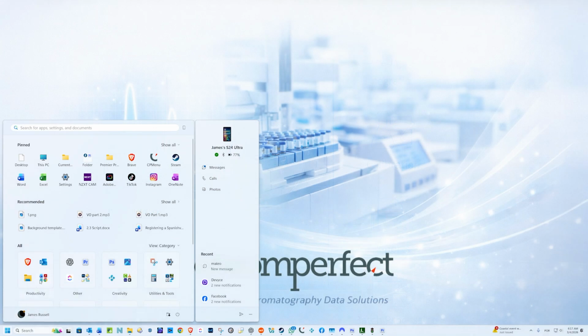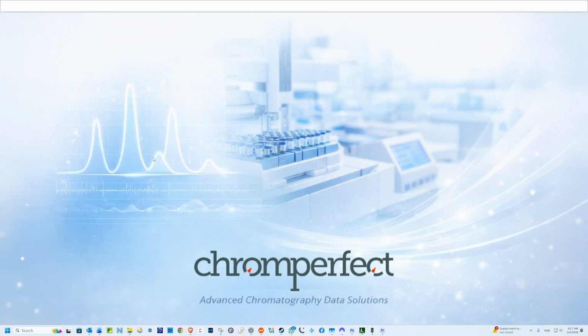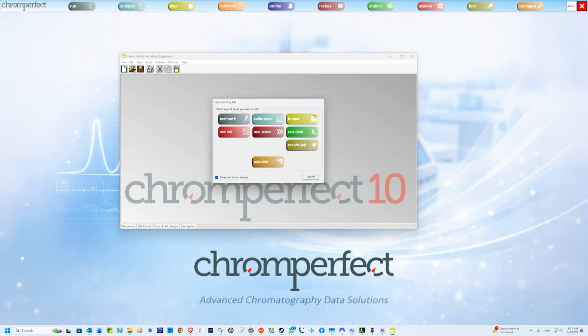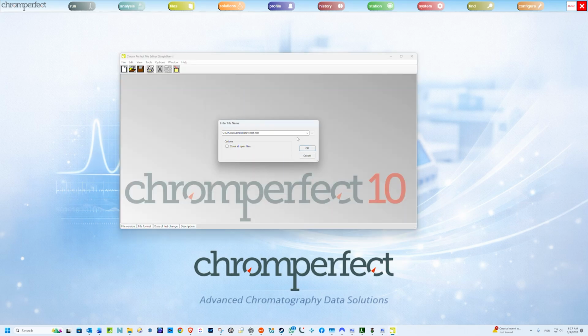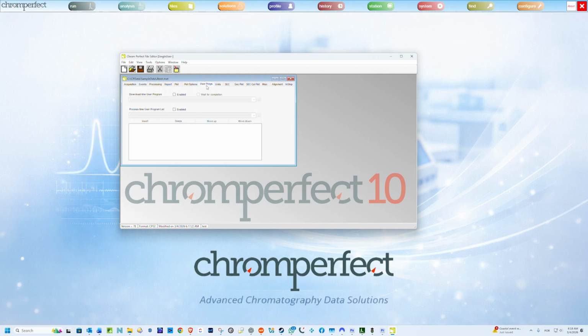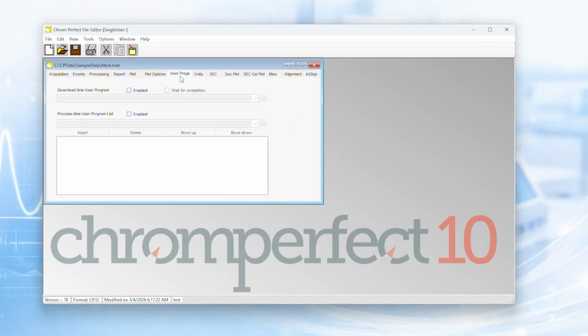When you first open the method editor, the number of tabs can feel overwhelming. The key to understanding this screen is not memorizing every field. It is understanding control boundaries. Only acquisition parameters determine whether a sample must be rerun. Everything else controls interpretation, reporting, or output. Let's move through the tabs in order.